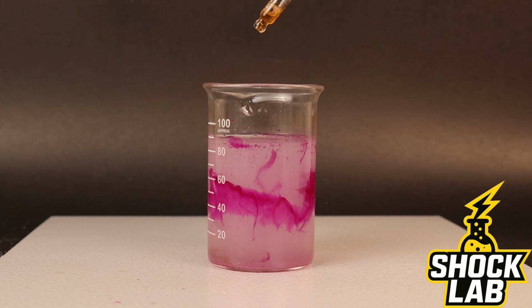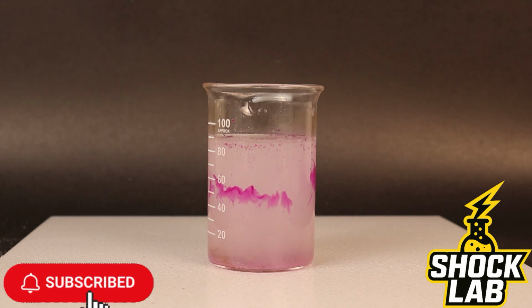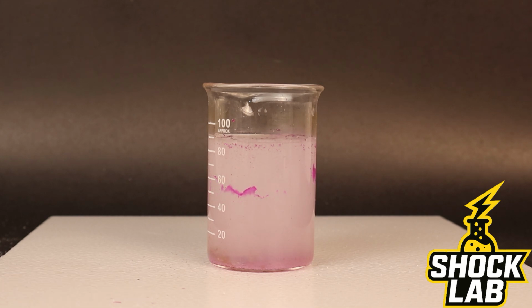Next, I slowly add sulfuric acid. The sulfuric acid reacts with the calcium hydroxide and neutralizes the solution. As the pH drops, the pink color gradually disappears until the solution becomes completely colorless again.